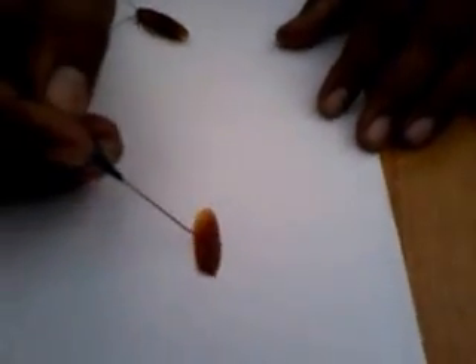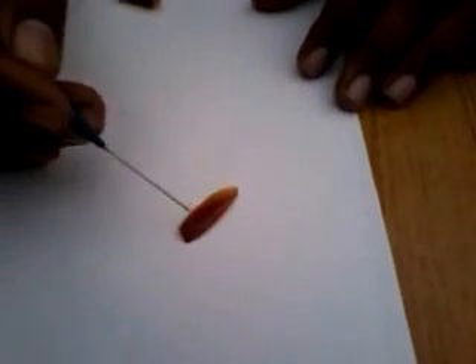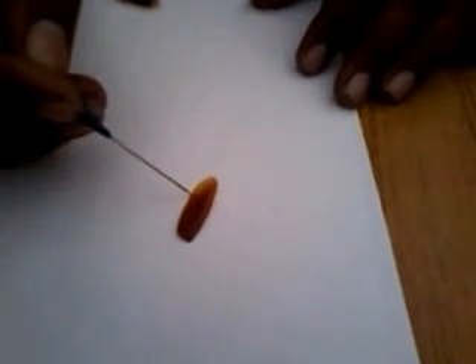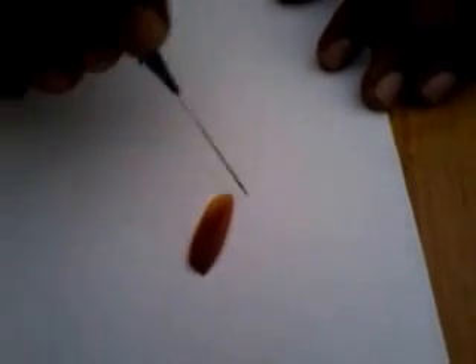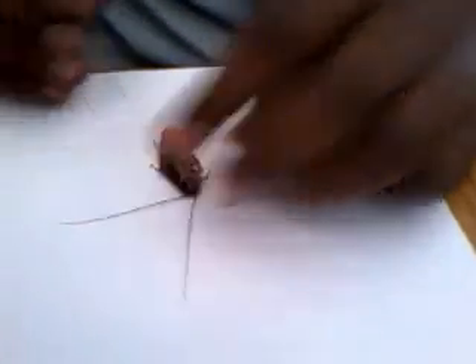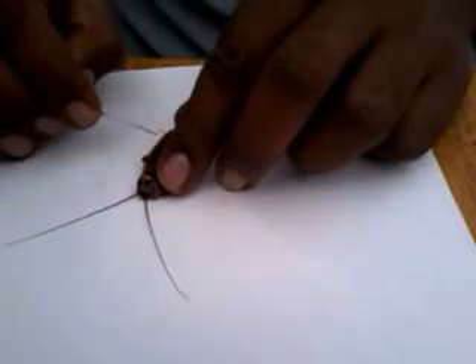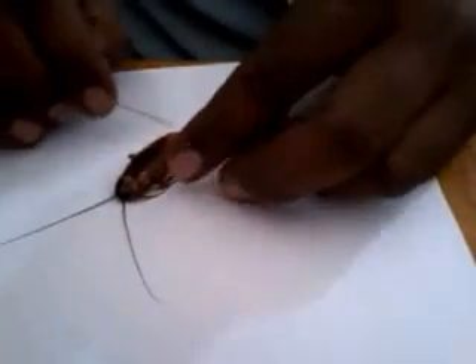This is the forewing. It is leathery in nature and it is not useful for flight — it is thick and leathery. It is protective in function and covers the hind wings, which are the functional wings used for flight.